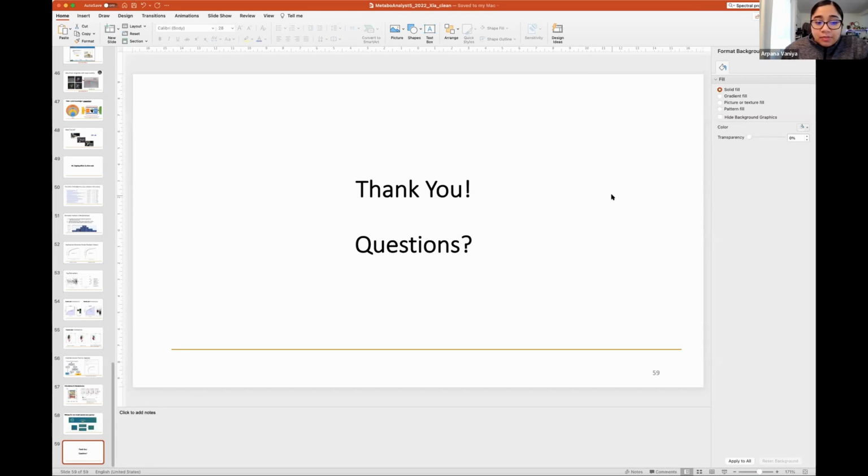There is a question here, and it's applicable to not only new users of MetaboAnalyst, but those who are getting started in metabolomics. What kind of raw data do we input into the MetaboAnalyst 5.0 platform for metabolomics analysis? So what is the input for this tool? We support all kinds of input, such as just CSV files. I know people want me to support Excel spreadsheets, but overall that's just a data table of the compound concentrations or peak intensity tables; you save as CSV and upload it. And you can also have a list of peaks or a list of compounds. So feel free to explore.